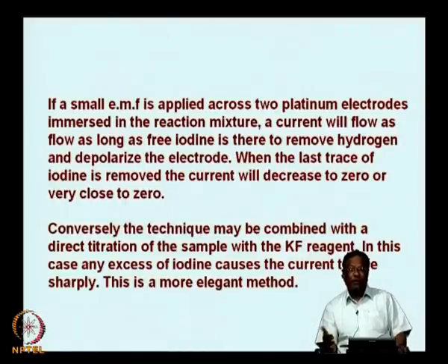So, dead stop reactions will exactly be able to pinpoint the end point of the titration irrespective of whether you will be able to identify the color change or not. As long as you are measuring the electric current, the moment it reaches 0, that is the end point. So, the electrometric end point for Karl Fischer reagent is much more reliable and dependable for the determination of water.